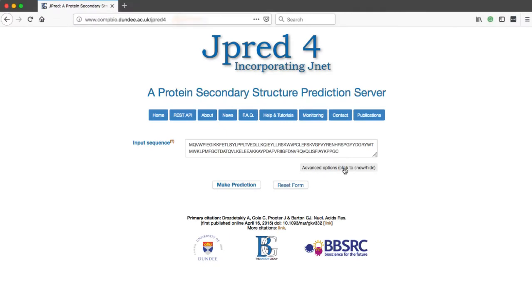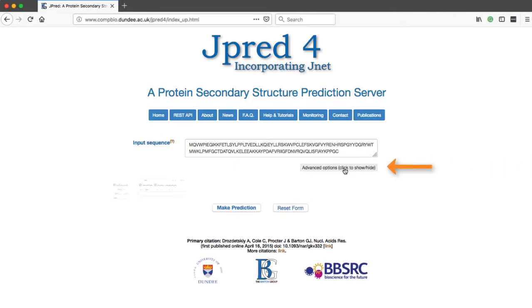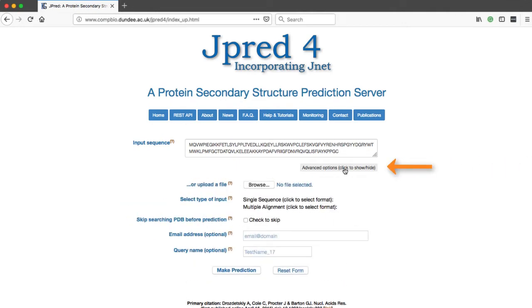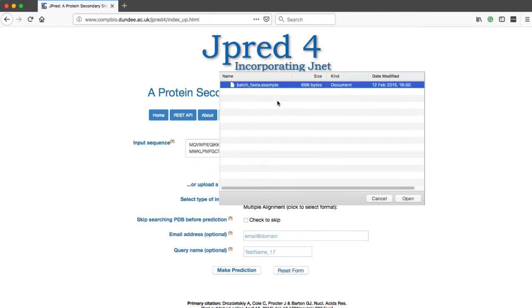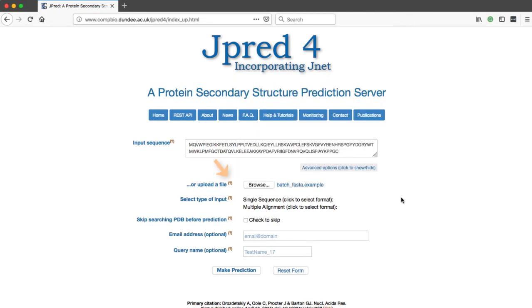To make batch submissions, click on the Advanced Options button. This expands the window. Click on the Browse button to upload the file. For more information about file types, view the tooltip.